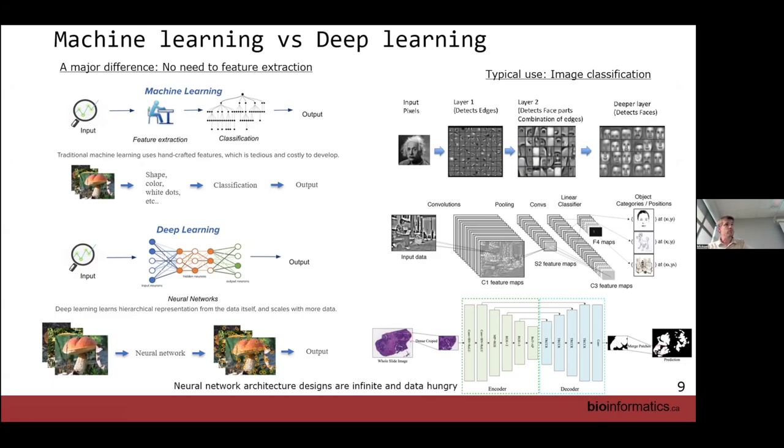And then you go to a classification procedure and you hope that you have extracted enough information to make your model. In deep learning, it's different. You go with your image and you go directly in the neural network. And the neural network's job is to extract information within your image. It automatically tries to dissociate information within it. You can imagine a picture where the different layers of the neural network will decompose the image and try to find specific edges, specific forms, and gather them together, compress them, decompress, recompress, etc.